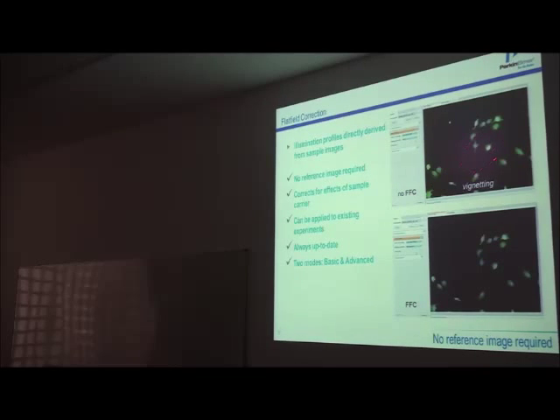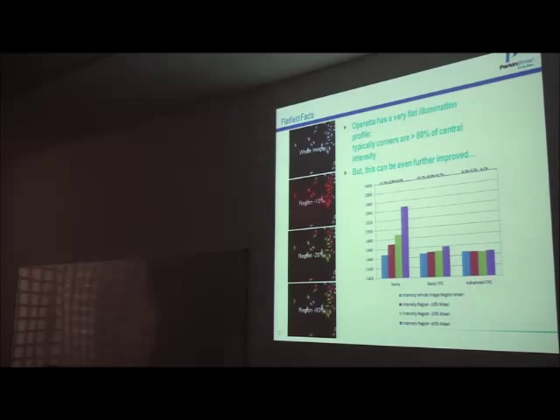The flat field, you see this bright center here, the background, is just a way to correct it. So if you have assays with floating cells, lymphocytes for instance, or blood cells. If you have assays where you are looking at toxicity, you don't want to wash too much, because if you wash, then you remove the dead cells, right? So in this case, you might end up in this situation. The software can just correct this for you using this FFC, but the originality here is that the reference images, the images which will be used for this correction, will come from the plate itself. During the measurement, the software will do it in the background to determine these reference images, and then do the correction. That's much better than what we've seen so far.